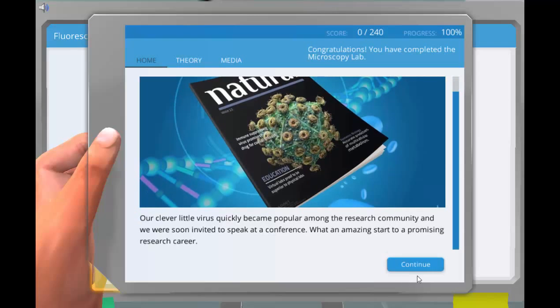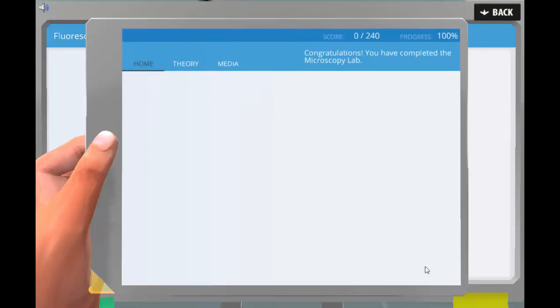Going through the microscopy lab, students learn about the advantages and disadvantages of different microscopy techniques.